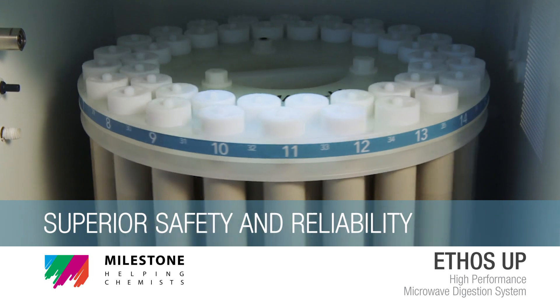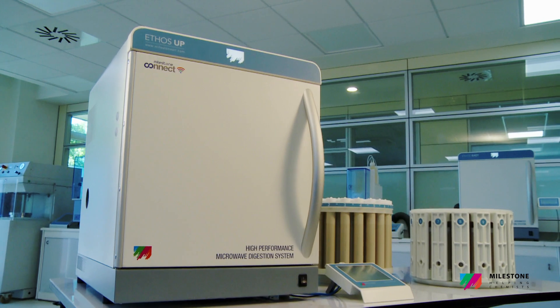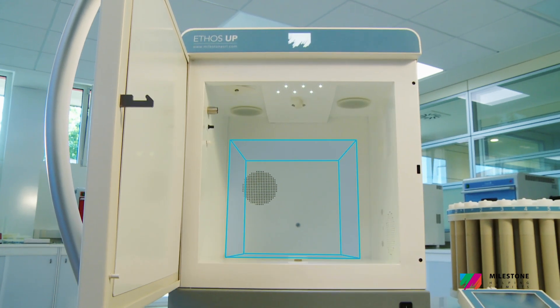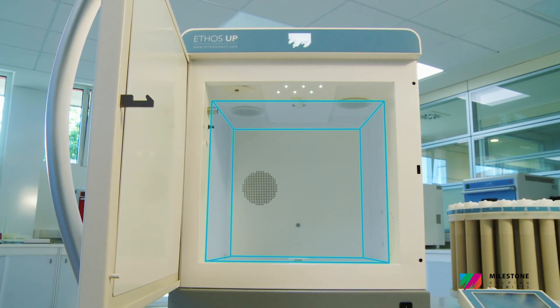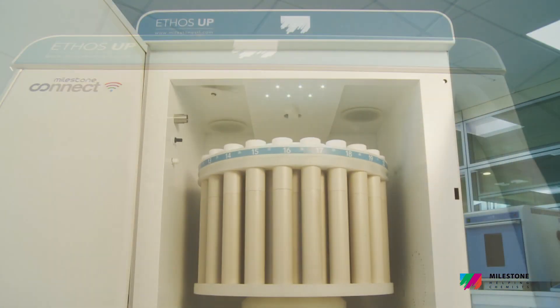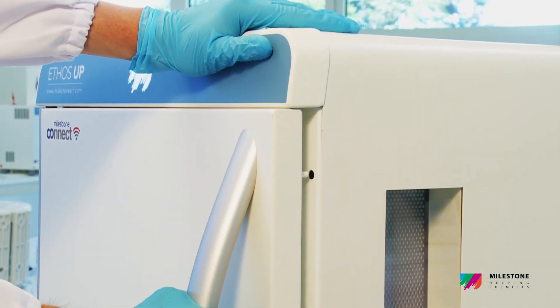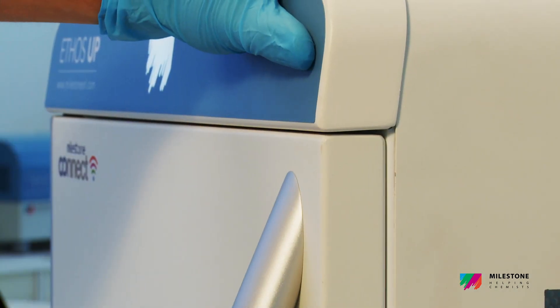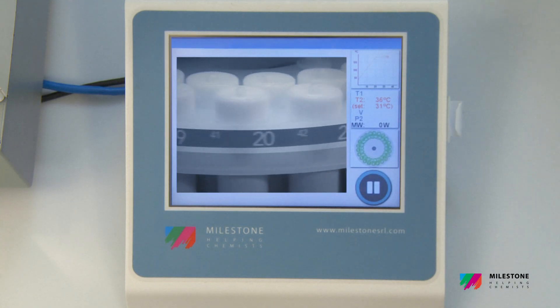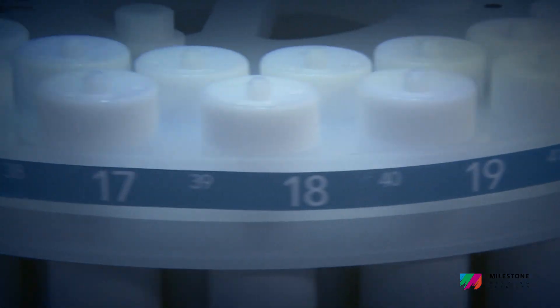Safety and reliability are Milestone's priorities. Both factors are present in the design of the Ethos Up. The cavity has a volume in excess of 70 litres and is entirely made out of stainless steel to ensure longevity and structural integrity. Our unique pressure-responsive door, also made out of stainless steel, ensures high safety, even with the most reactive samples. The high-definition digital camera, SafeView, allows safe observation of the microwave's cavity throughout the digestion cycle.